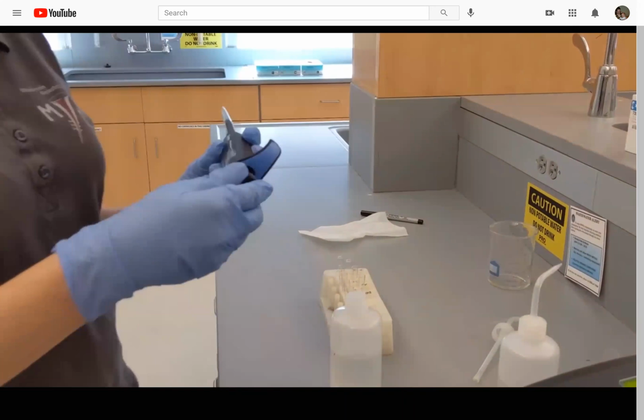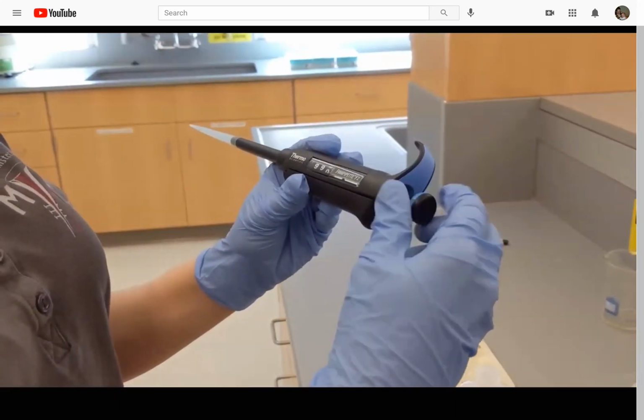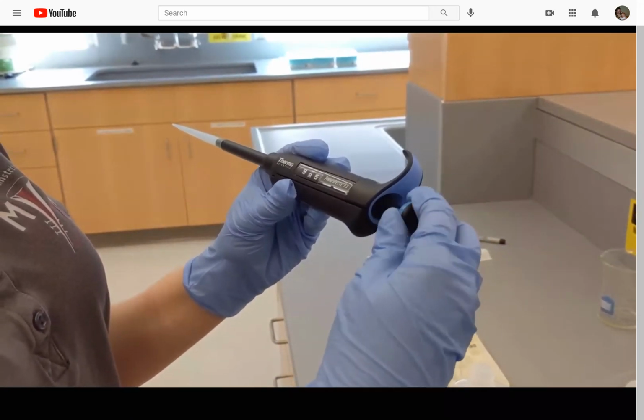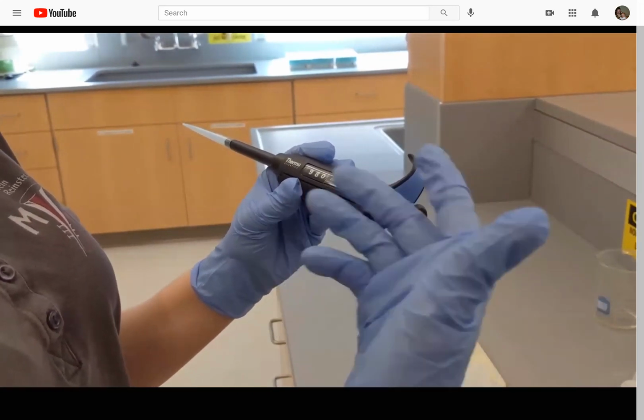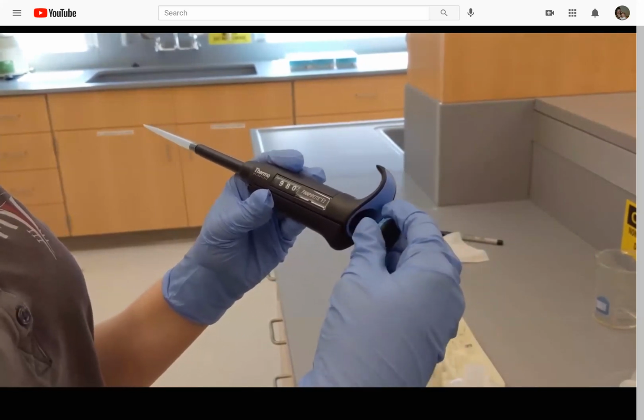I'm now going to adjust it by twisting the end. You also want to make sure that you never twist it above the amount that the micropipette is capable of measuring. This could also cause damage inside the instrument and cause it to read less accurately.